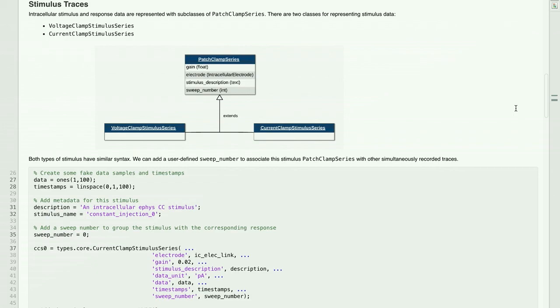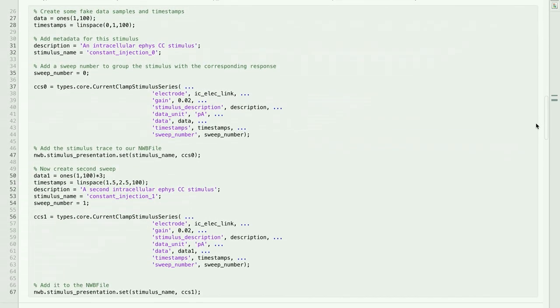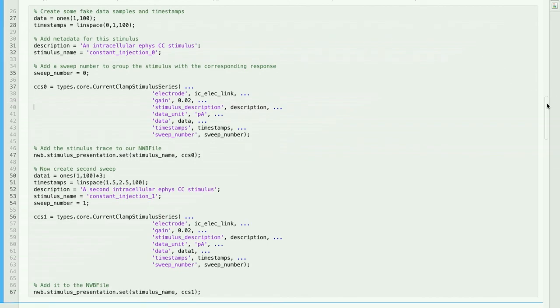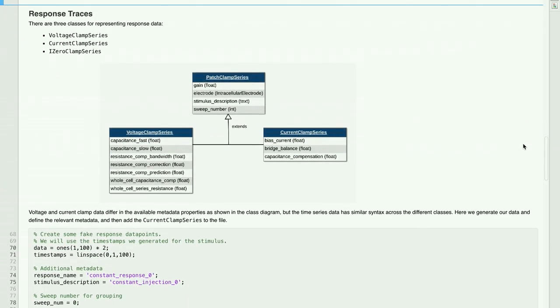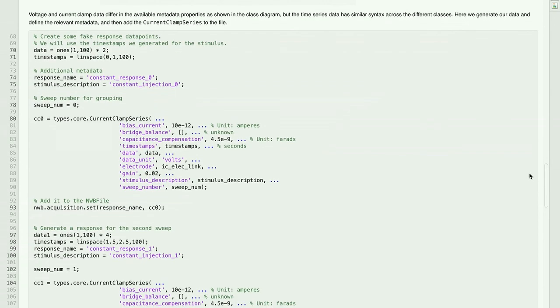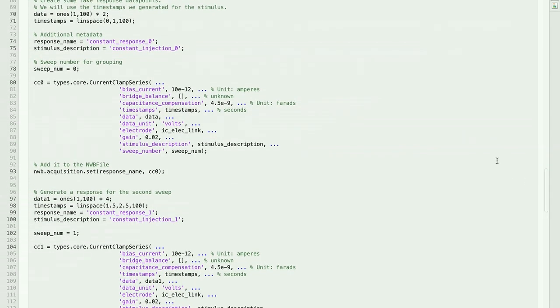Now we can go ahead and add some stimulus traces to our file. I will also add user-defined sweep numbers that allow us to associate stimulus patch clamp series with other simultaneously recorded traces. Here I am creating two current clamp stimulus series that share the same intracellular electrode but have different sweep numbers. Similarly, we can add response traces to our NWB file. Here I am going to generate two current clamp series that have the same sweep numbers as the current clamp stimulus series I just added. Response data gets added to an NWB file using the acquisition.set method.